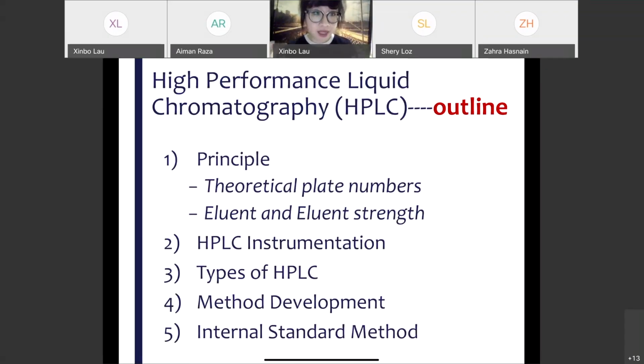And then the other big instrument, or the other type we want to talk about for chromatography, is HPLC, high performance liquid chromatography. As I said, from previous semesters, because that was in person, people got very creative about HPLC, coming up with all sorts of abbreviations. But I hope you know it and don't have to search for it during the exam, because that would just be wasting your time. So let's focus here real quick. HPLC is high performance liquid chromatography. Okay, so that's what it represents.